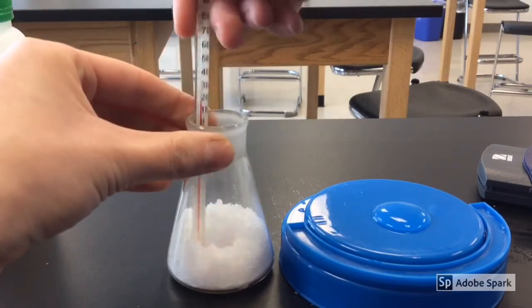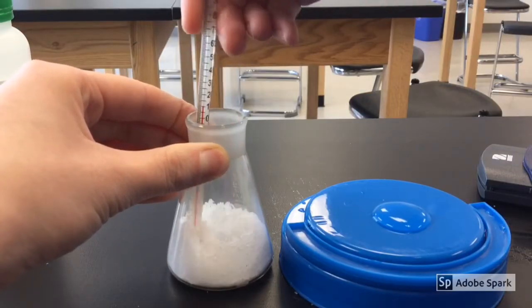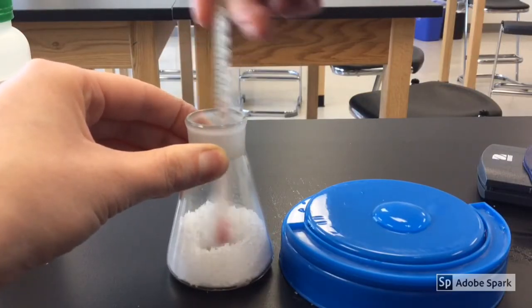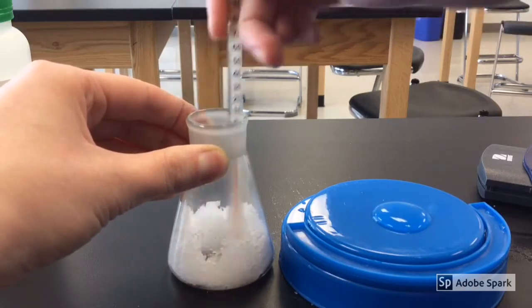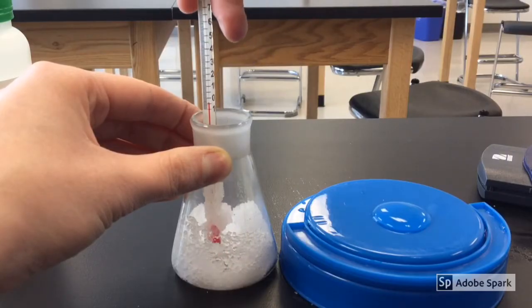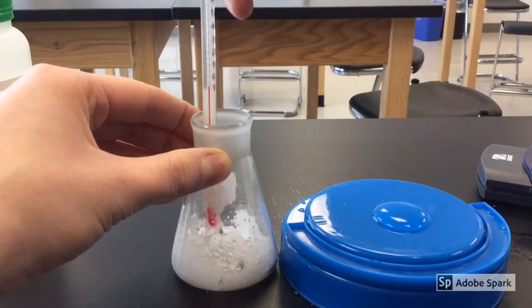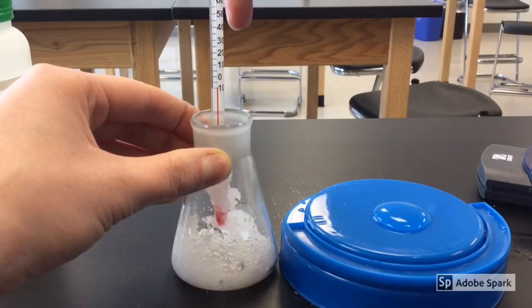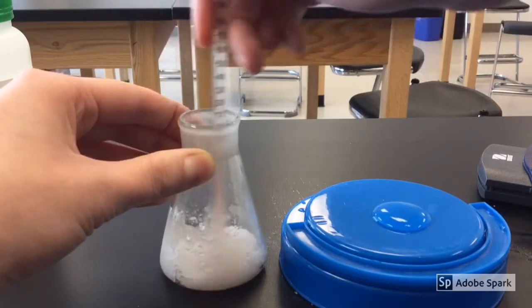I'm going to go ahead and start mixing this. Pay attention to what's happening. I'm mixing my barium hydroxide and my ammonium thiocyanate — just mixing those nice and good together. We can already see my temperature has dropped a lot, like really fast. Remember how it said 20? Now it is about negative 10 degrees. So that's exciting — really fast reaction.